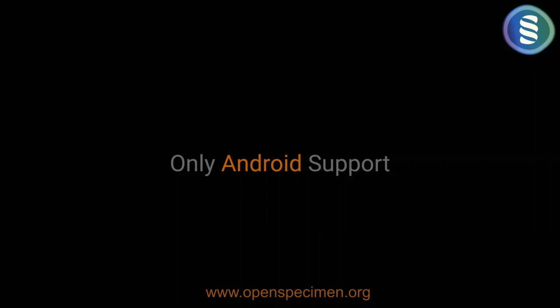These are dedicated devices bought for the lab, and Android is much cheaper than iPhones or iPads. So Android is a much better target for us. When we develop mobile apps, there is additional effort in supporting each additional platform. It's not like a web app that we develop on one platform and then it works on Safari, Microsoft Edge, Chrome, all in one go.